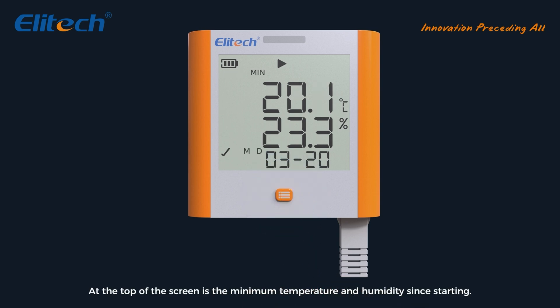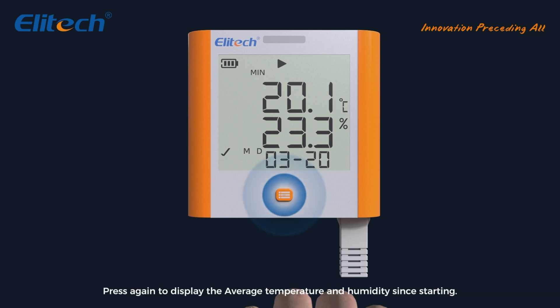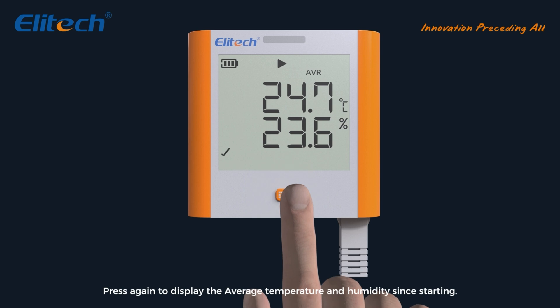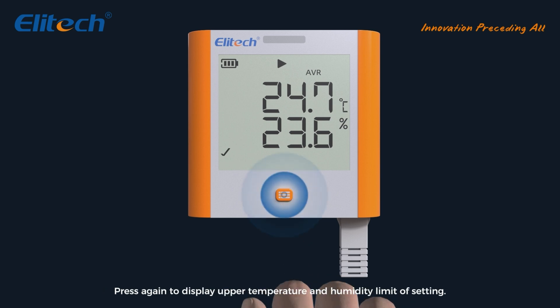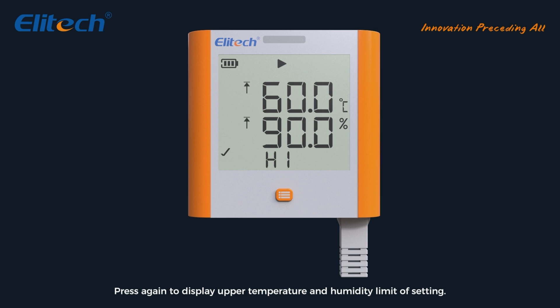Press the button: at the top of the screen is the minimum temperature and humidity since starting. At the bottom of the screen is the month and day. Press again to display the average temperature and humidity since starting. Press again to display upper temperature and humidity limit of setting. Press again to display lower temperature and humidity limit of setting.